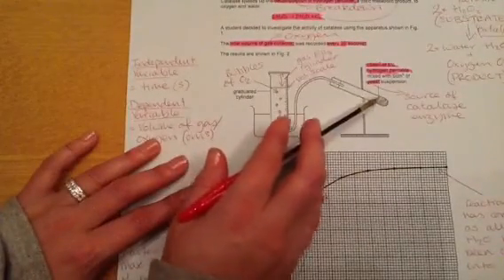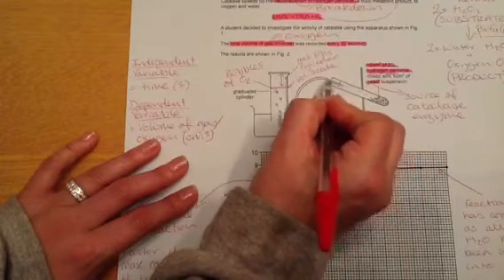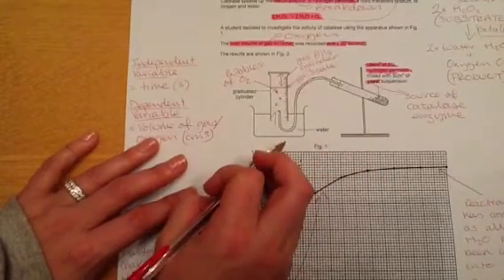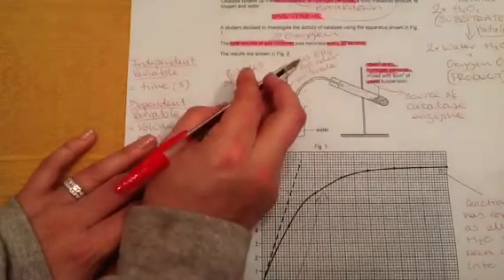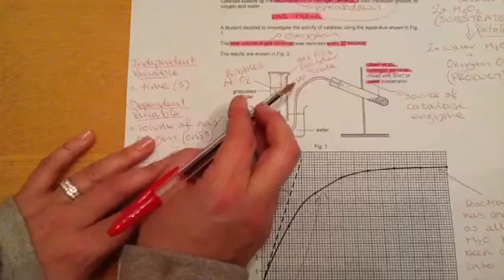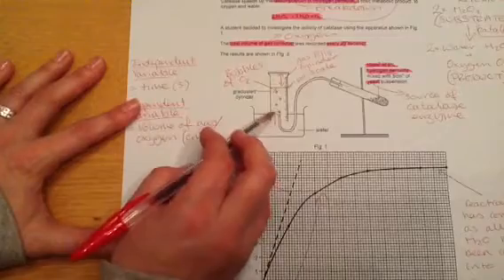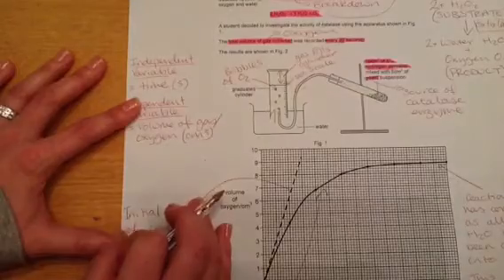Now, as this reaction occurs, the oxygen being produced will start to progress up the tube, through this tube here, and eventually up into this inverted cylinder. And the gas will accumulate up at the top here. So this space here is representing the gas that's accumulated. We have a scale on the side of a measuring cylinder, so that can be used to measure the volume that's present. And these bubbles obviously must be the bubbles of oxygen as they're being created in this reaction here.